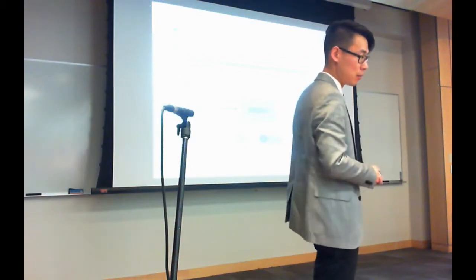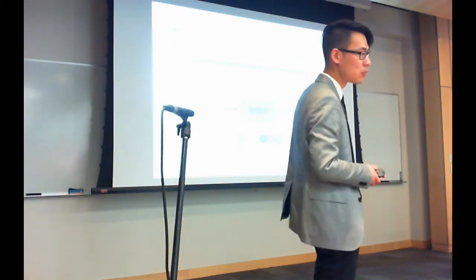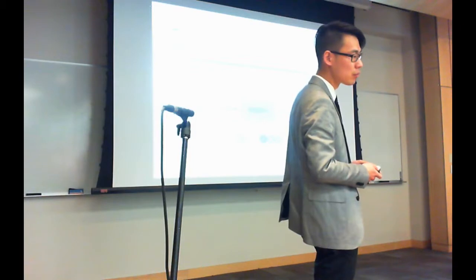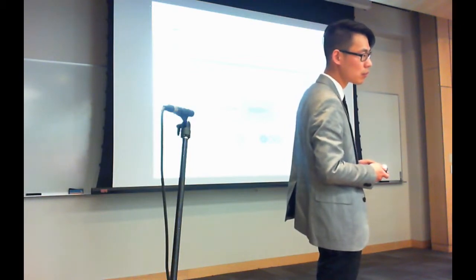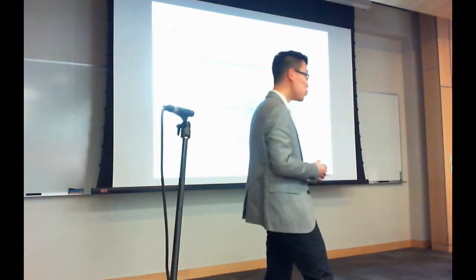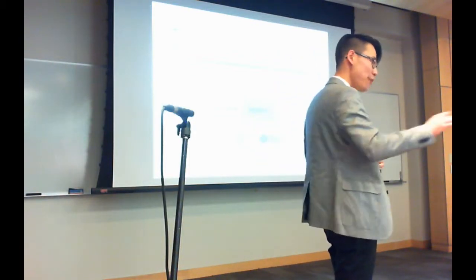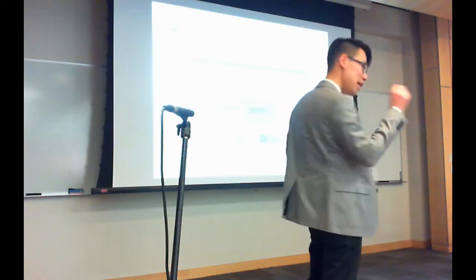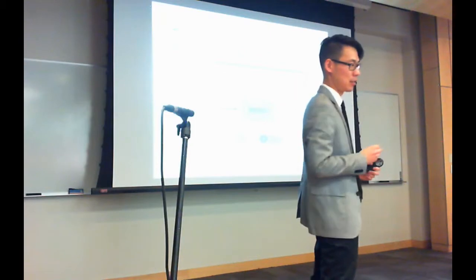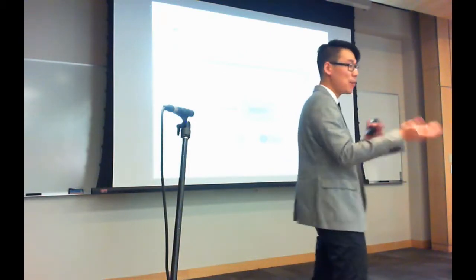I'm not talking about local FDR. I'm talking about only reporting PSMs with zero FDR, which means PSM p-values that are below any p-value in the decoy. If you do this globally, I imagine you might be okay. But you have to do it appropriately, because if you do it on the PSM basis, you might still be screwed at the precursor basis. Because if you will still have some error, there's going to be something wrong.